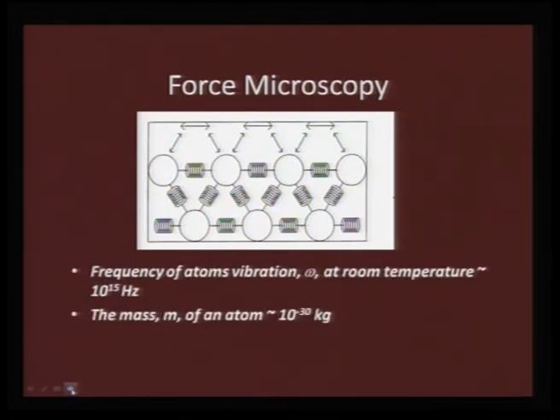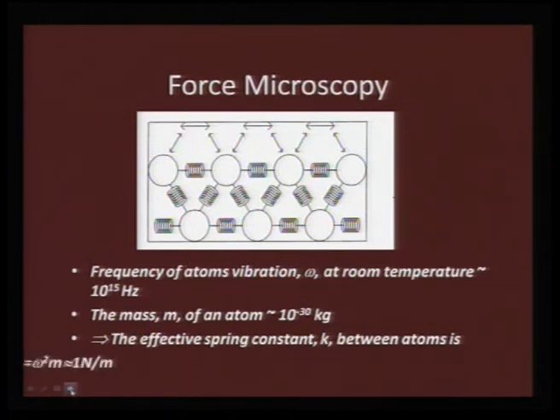In this force microscopy, the numbers that we need to understand have to do with the force constant. The frequency of the atoms' vibration is roughly of the order of 10^15 hertz, and the mass of an atom is of this order. Therefore, your spring constant is roughly 1 newton per meter.